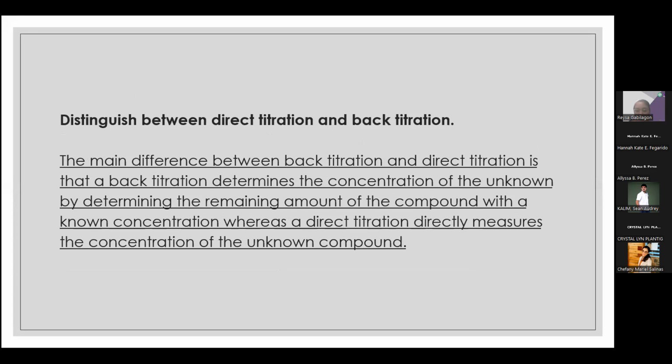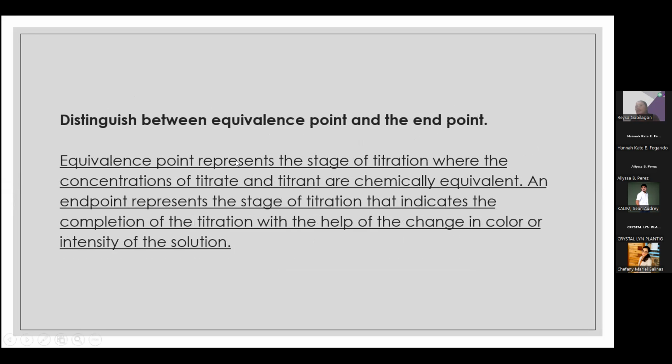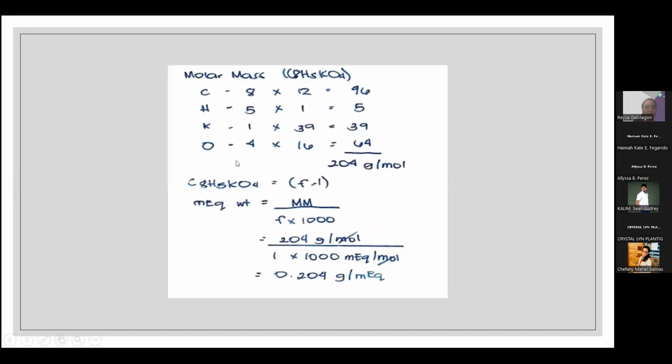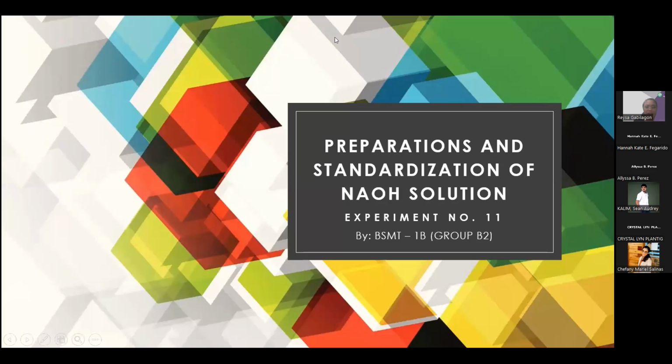Nag-skip ata tayo ng experiment, no? Meron pang sa gitna nito, diba? Experiment 9. I think this is experiment... Hindi ko na masundan ang numbers ng experiment. This is 11. So, merong experiment 10 pa pala. Let us check. Okay. So again, this is acid-base titration, preparation and standardization of sodium hydroxide solution.